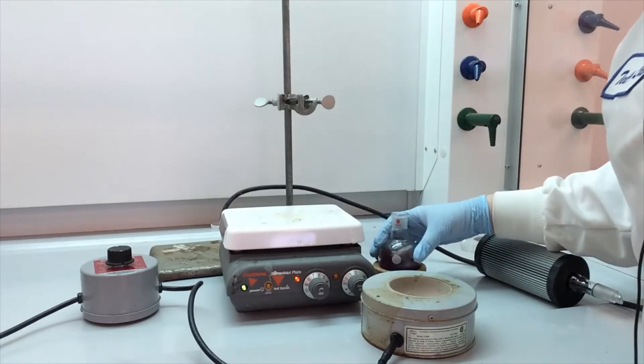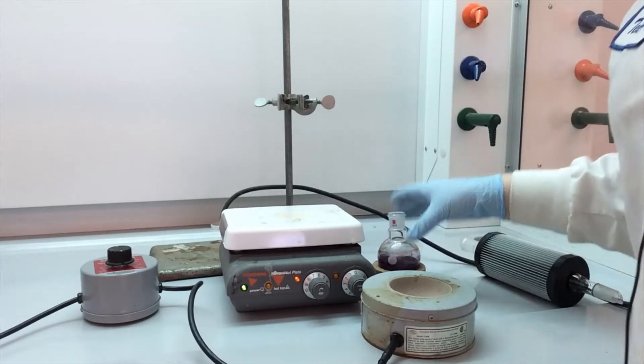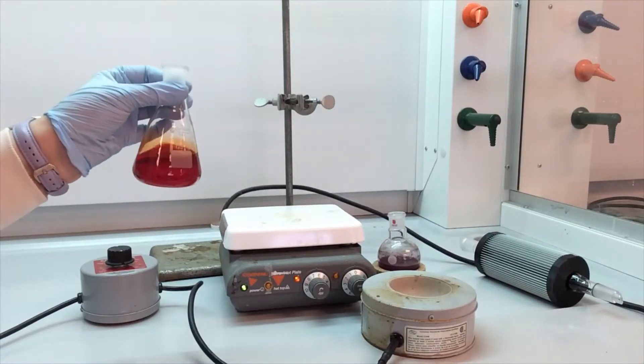I'm going to show you two different setups, one using a round bottom flask and the other using a flat bottomed Erlenmeyer flask.